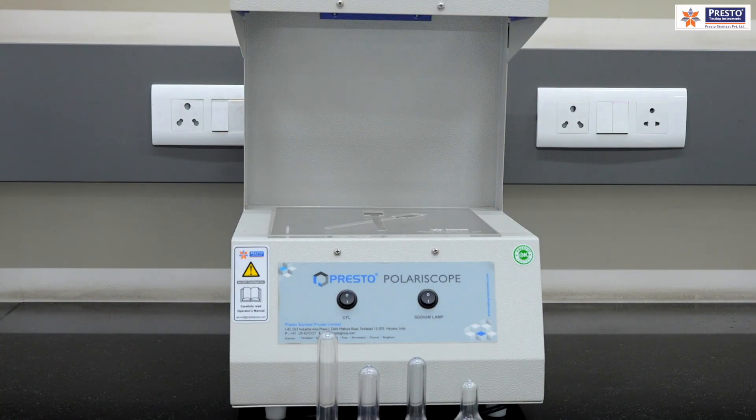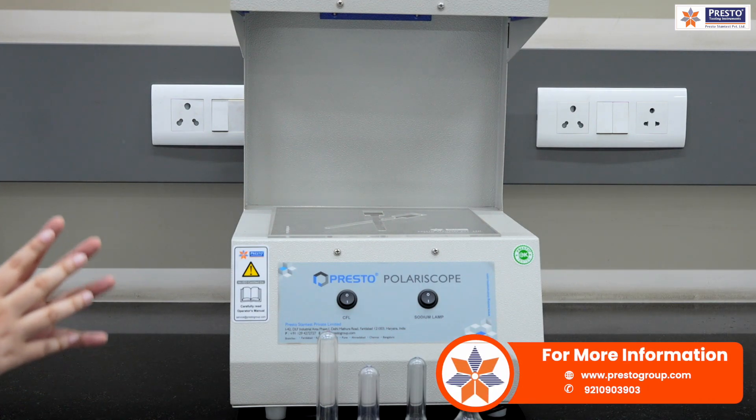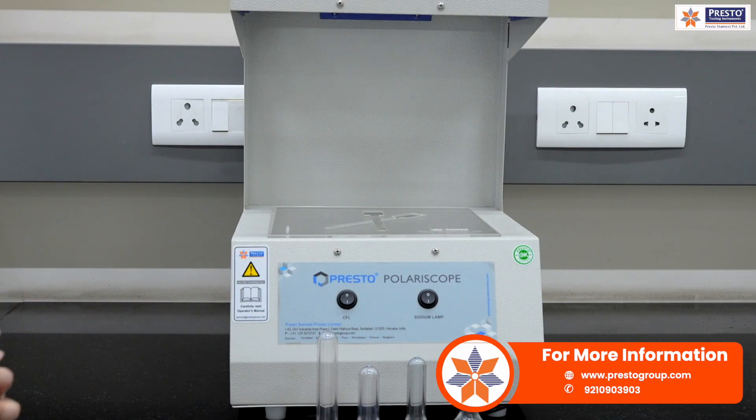The purpose of a polariscope is to see the residual stress in the sample, which we cannot see through our naked eyes. It follows the ASTM D4093 standard, which specifies how a polariscope should measure residual stress in a sample.